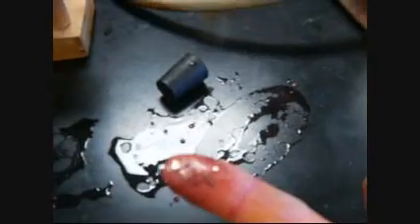Now let's see what that stuff is. I just pulled some of that brown solid off of there, because what I want to do is shine it up. See if you can see the shine of the copper. So that brown gunky solid is apparently solid copper.